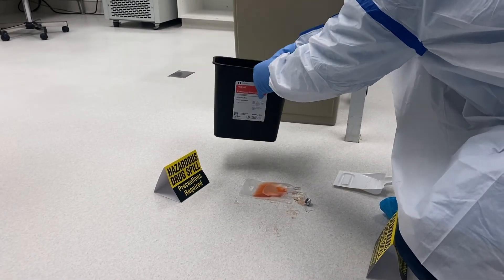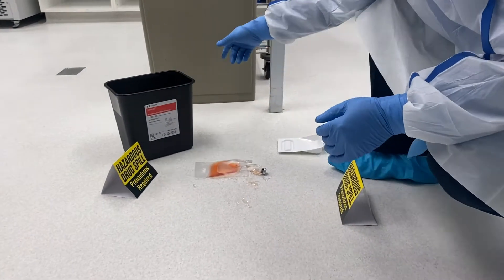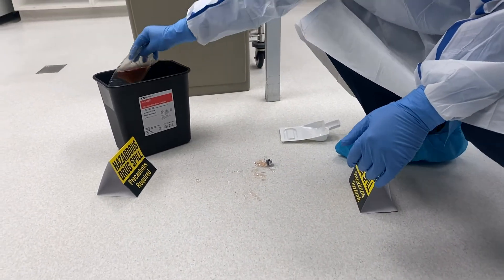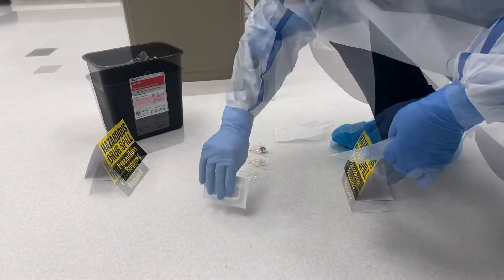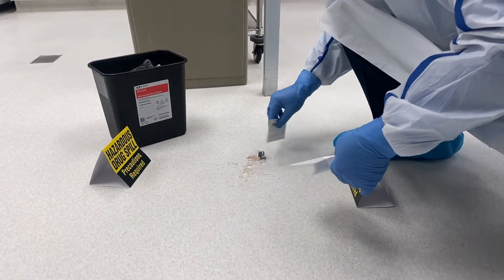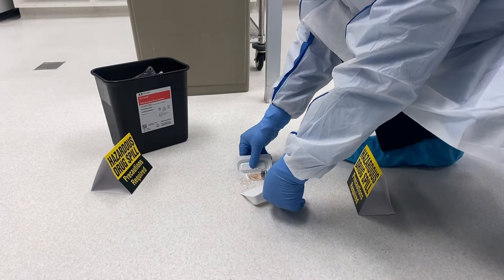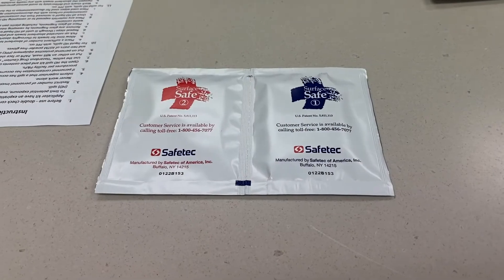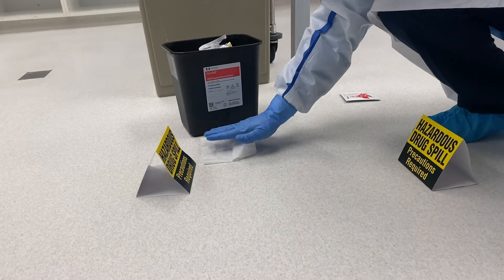If glass is involved with the spill, use the plastic pan and plastic pusher to sweep up the glass fragments and dispose of them into the black RCRA container. At this time, please place any materials in the RCRA container that may have been exposed to or containing HD — for example, tubing and IV bags.